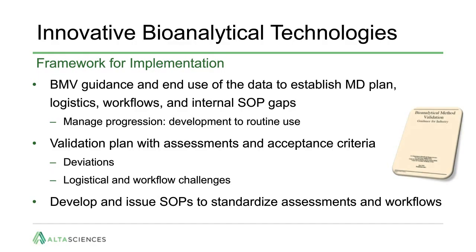Our approach for transitioning a new technology to routine use has been to review the bioanalytical method validation guidances, the scientific information, and the end use of the data to establish a method development plan. We evaluate the impact of the new technology on our standard logistics and workflows and determine the adjustments that need to be made. We review the content of our general SOPs and look at our method SOP templates to identify and address the impact of the new technology.